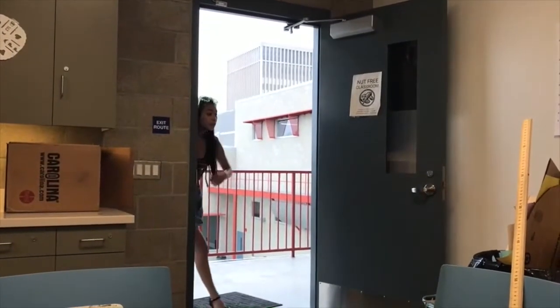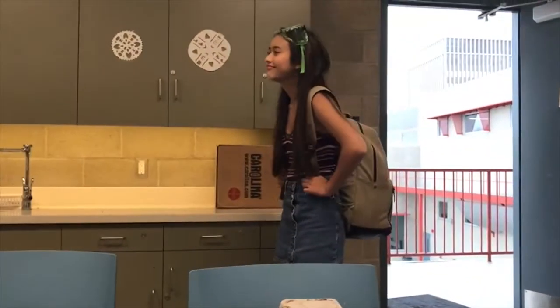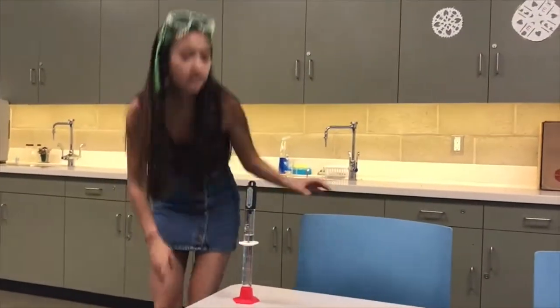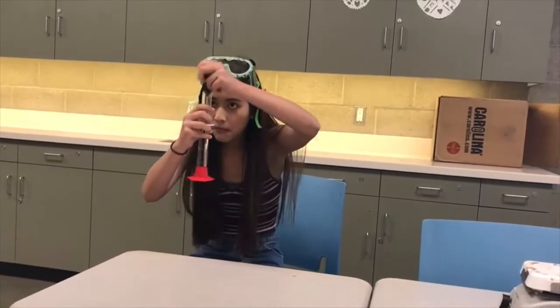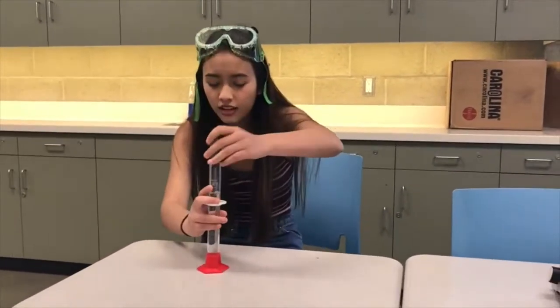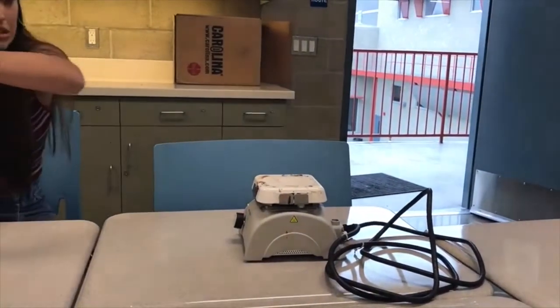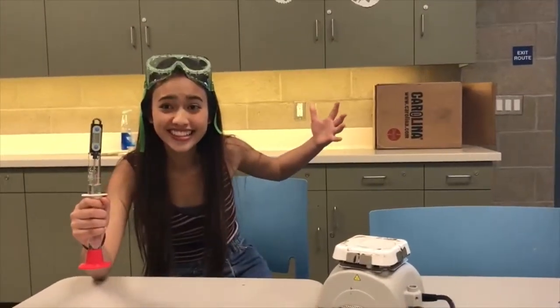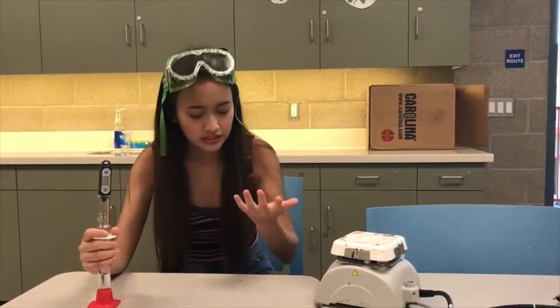This is my story. It was a warm day in May when disaster struck for Taylor. She came into the lab feeling excited and dressed to impress. Setting her backpack down, she began her reaction in a graduated cylinder. Suddenly, she realized that she needed the hot plate. A master multitasker, Taylor reached over the table and grabbed the hot plate. Ah, that's hot! Taylor now had second-degree burns on her hands. In pain to the point of delirium, she ran to the nearest sink.